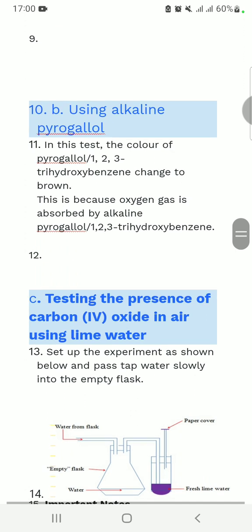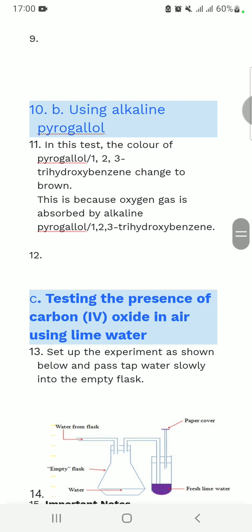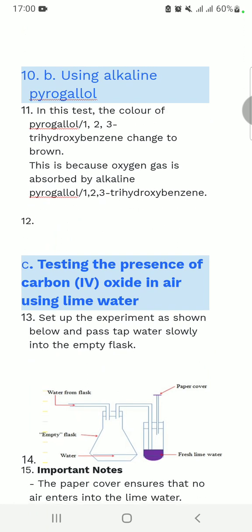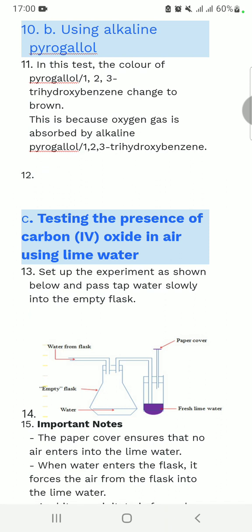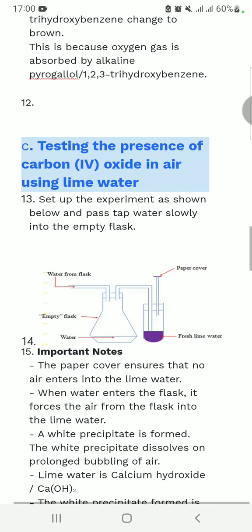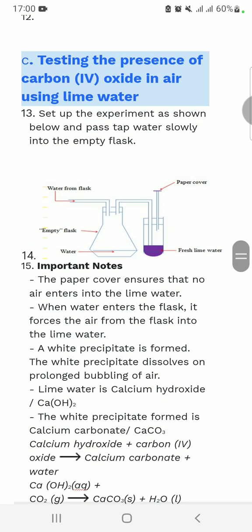We are going to use alkaline pyrogallol. The color of pyrogallol changes to brown because oxygen gas is absorbed by alkaline pyrogallol. Now, testing the presence of carbon dioxide and its effect on lime water.